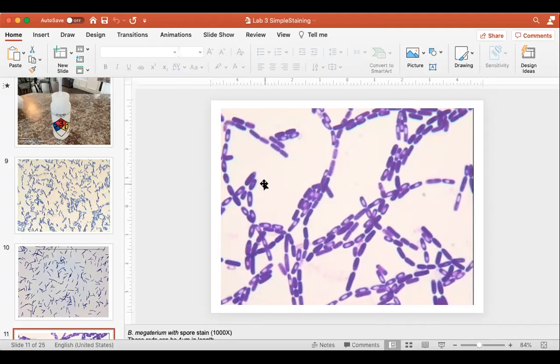But over the next couple of days in that test tube, they were using up all the nutrients. They were generating a lot of waste material, and they started to get stressed. In the laboratory, if we wanted to keep these cells going in culture, we would have to give them some fresh broth. Otherwise, they would sporulate and we wouldn't have living cells anymore.